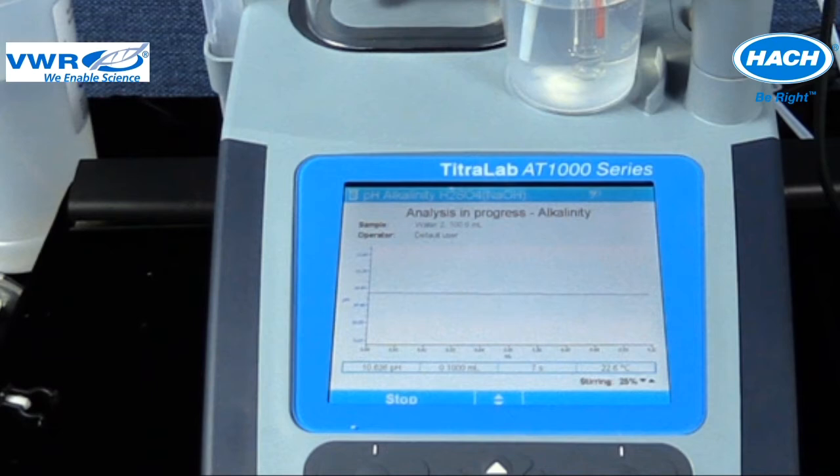The methyl red, methyl orange, or total alkalinity is determined by an endpoint of a pH of 4.5. This portion of alkalinity is arbitrarily attributed to the hydrogen carbonate and hydroxide concentration of water. The concentration unit for alkalinity is reported as calcium carbonate, or CaCO3. The number of detected equivalent points depends on the initial pH of the solution. By definition, P alkalinity is 0 for water which has a pH value of 8.3 or less.